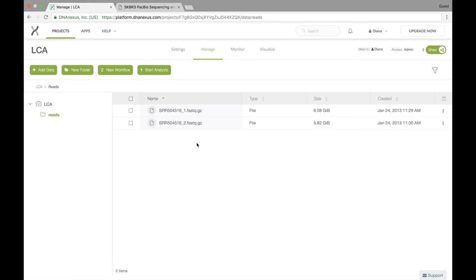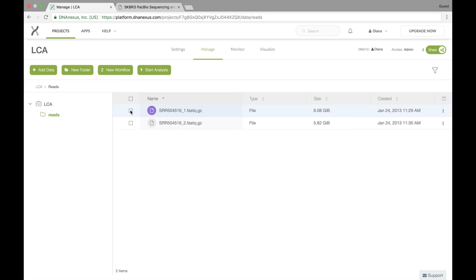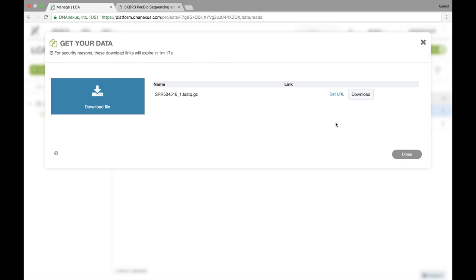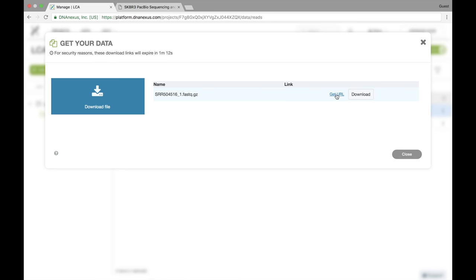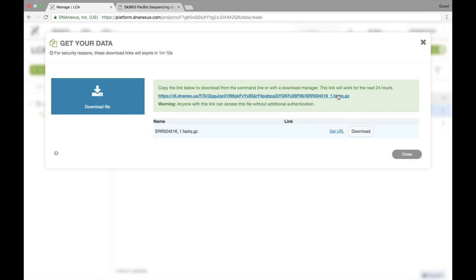In addition to sharing the whole project, I can also share individual files and I can do that by creating a download URL. If I select this file, I can go over and hit the download button or I can right click and say download. From this screen, I can decide to download the data directly onto my computer, which will start immediately, or I can create a download URL.